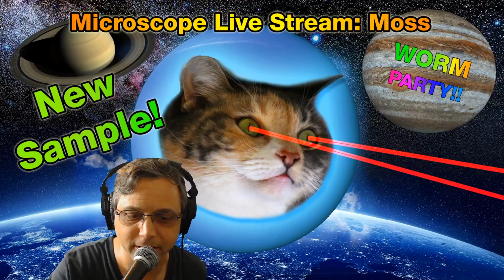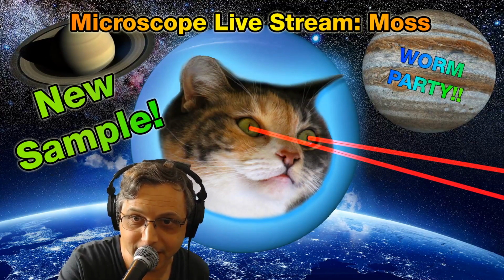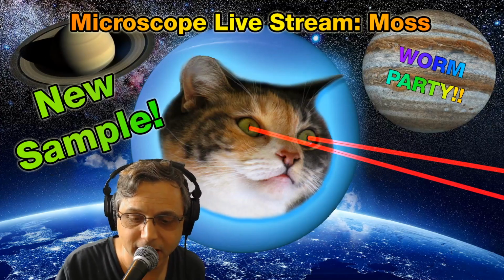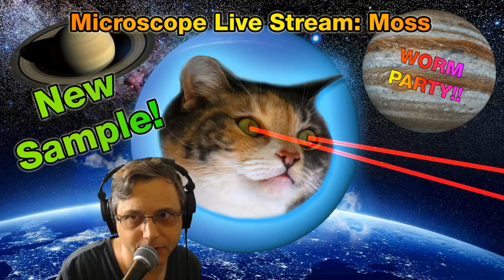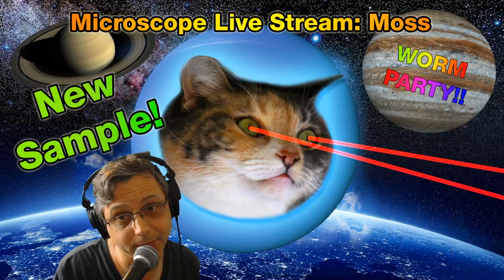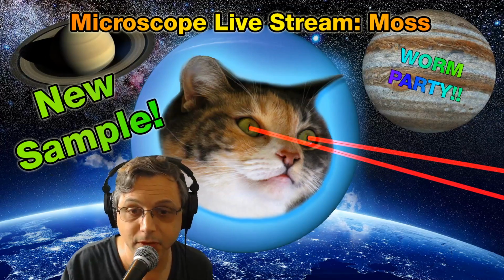If anybody is joining us, I don't know. We'll see. But we're going to look at some more samples today. Actually, I have some moss I grew on dirt. I expect worms in that sample. So, we'll see what happens with that.